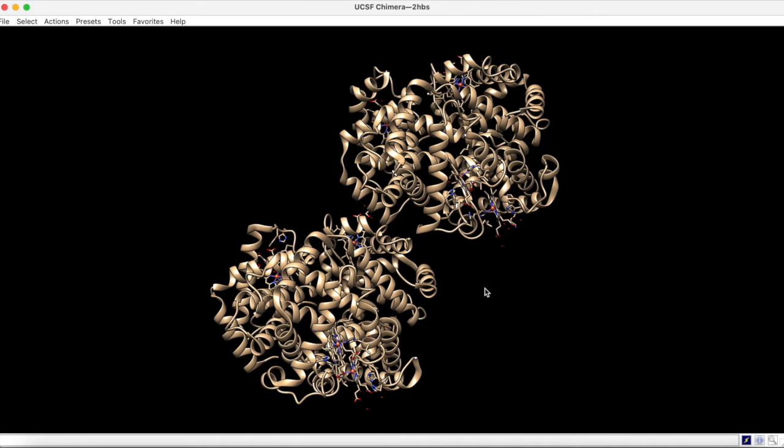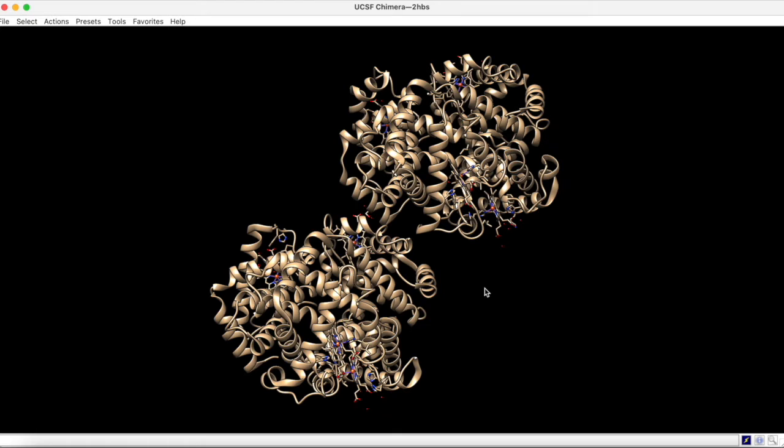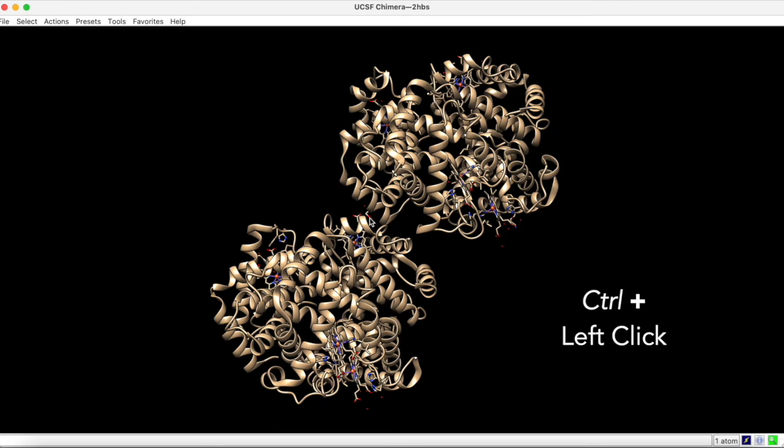Upon examining the interface between the two globular regions, it appears that certain residues have their side chains shown. To select one of the atoms in these side chains, use Ctrl plus left click.